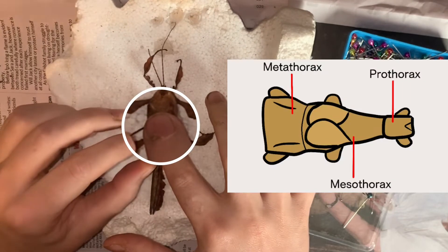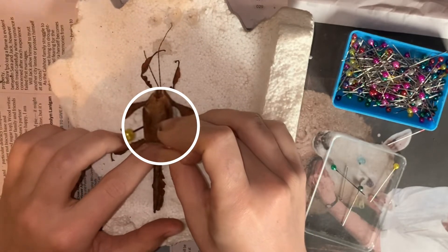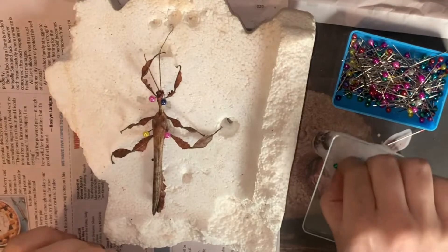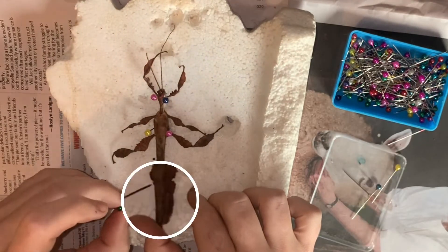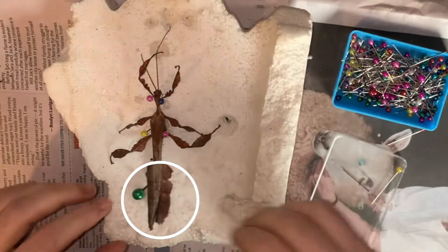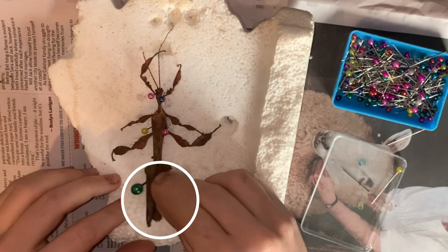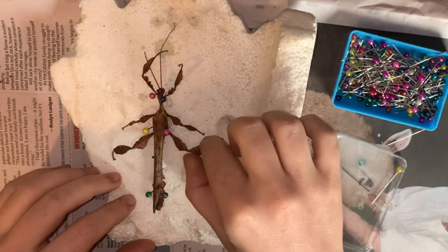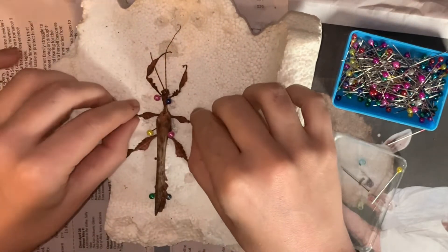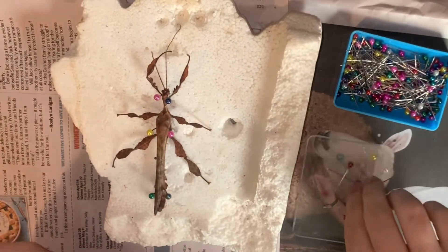Two more pins are then added to either side of the metathorax, and two more on either side of the lower abdomen. These first few pins will keep the insect sturdy for when you begin the more tedious work with the limbs. After the body is pinned into position, we can then move on to the hind legs.